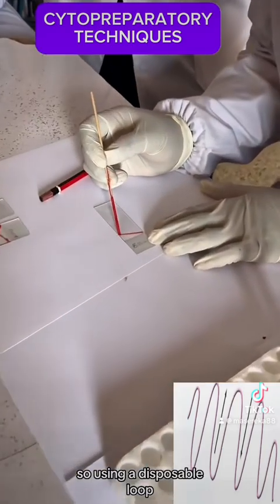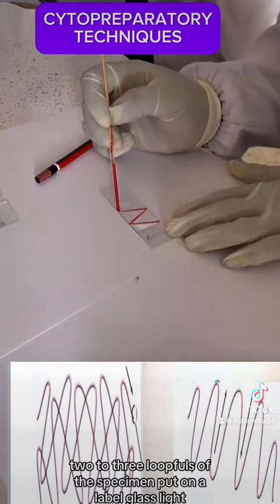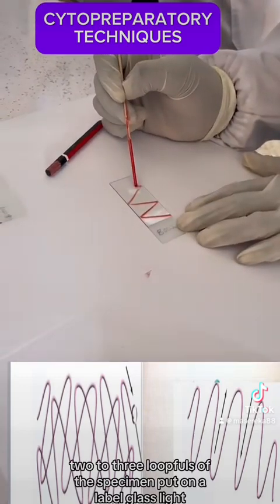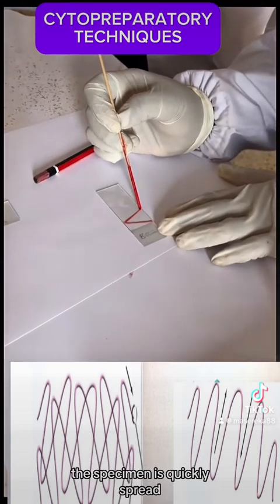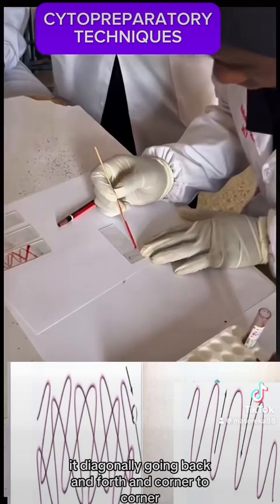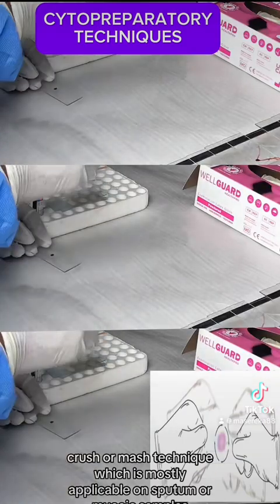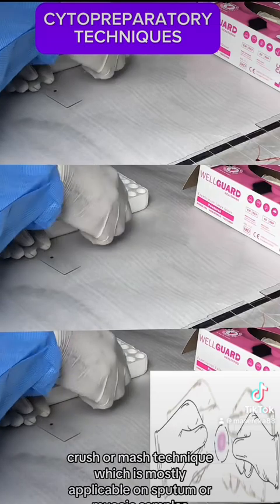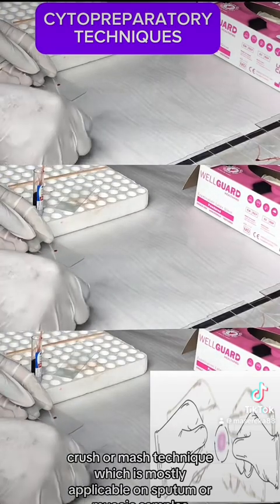So using a disposable loop, 2 to 3 loopfuls of the specimen are put on a labeled glass slide. The specimen is quickly spread diagonally, going back and forth and corner to corner. Number 4, crush or mash technique, which is mostly applicable on sputum or mucoid samples.